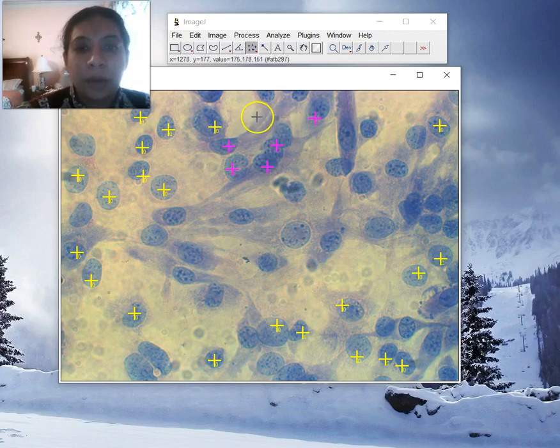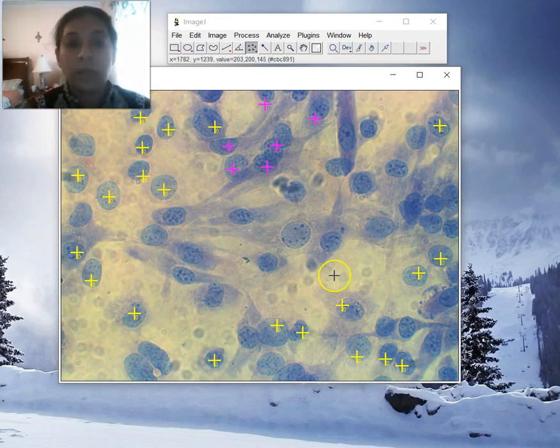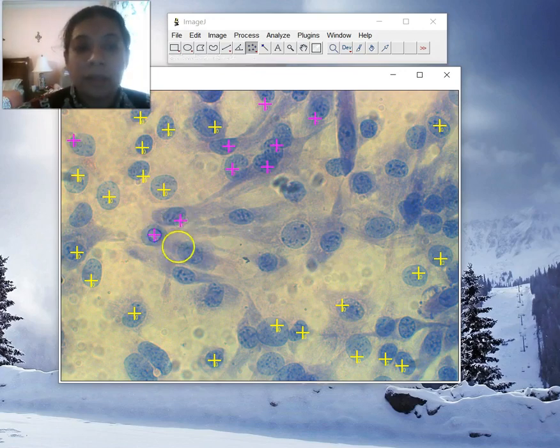As you can notice, it now automatically changed the color of the first crosshairs, and it gave them all a 0 instead of the number label that they had. Before, it was counting them and showing the counts. Now it's not showing the counts, and instead it's just showing a 0, letting us know that they were all categorized similarly by the system, or by us in this case.